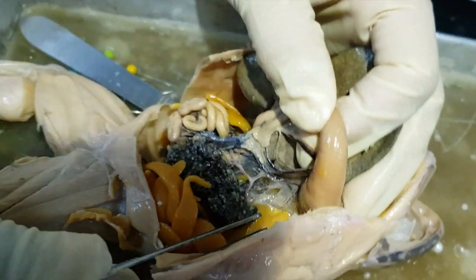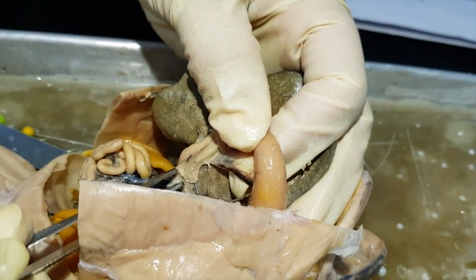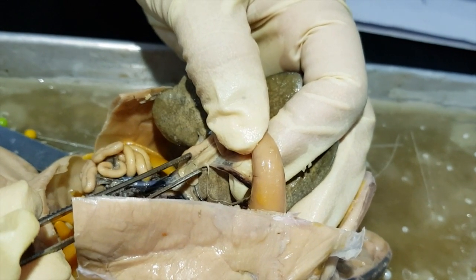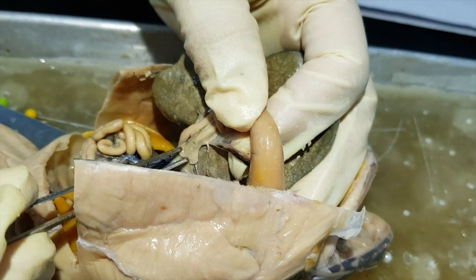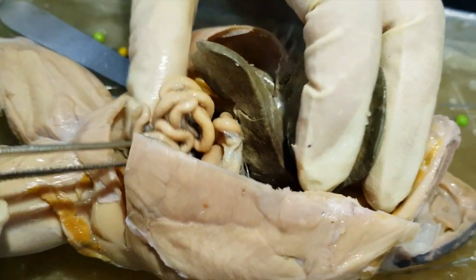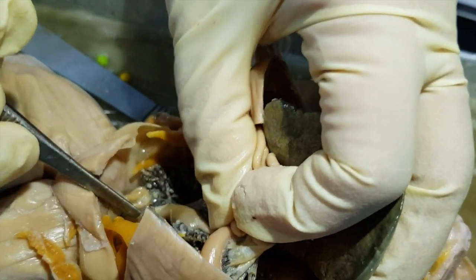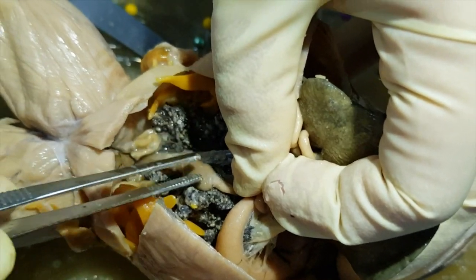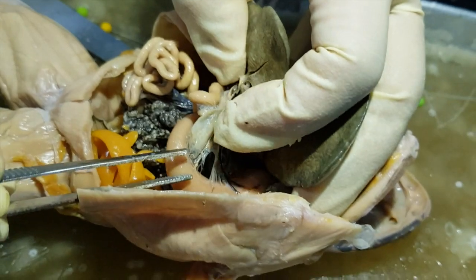Then if you lift the stomach, this structure here is the pancreas, that whitish organ, in the mesentery of the gastrohepatoduodenal ligament. Then this is the coiled small intestine, and then it tapers to a rather much straight large intestine. So this is the large intestine, then the coiled small intestine, then the stomach.